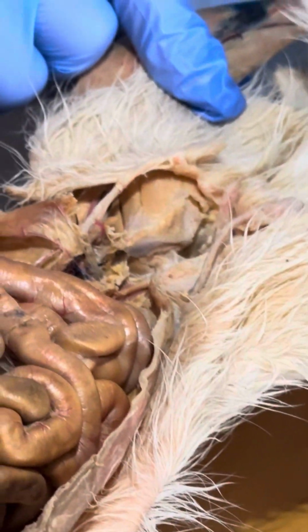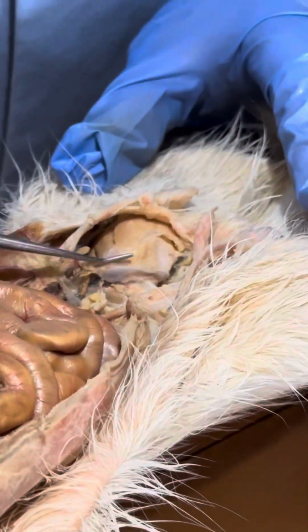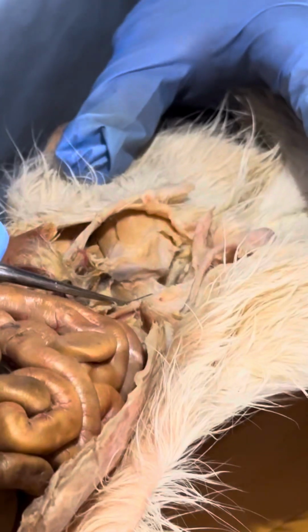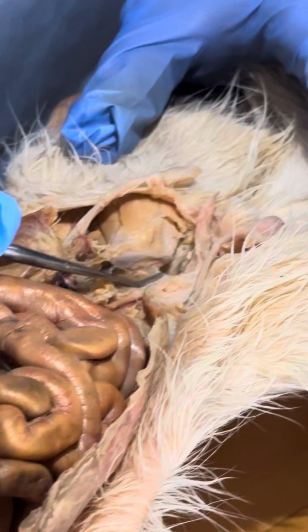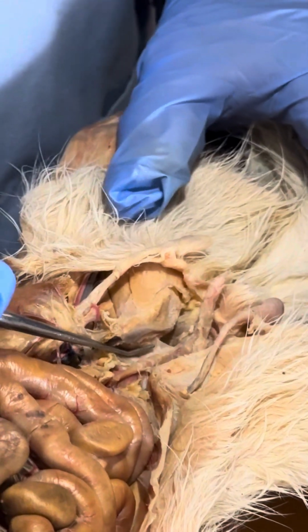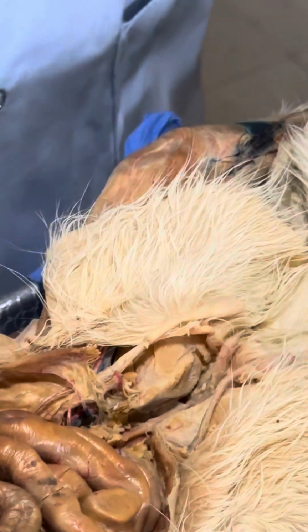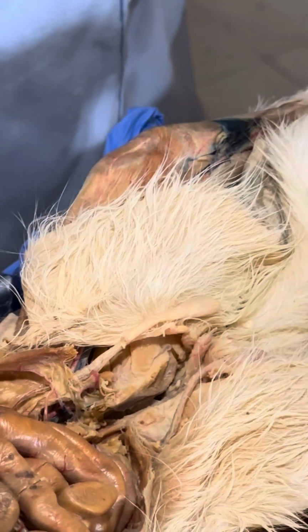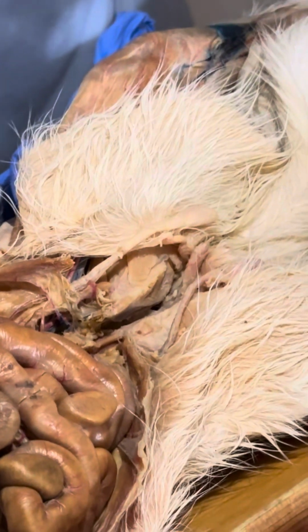And so what we have here, and you can see this on the female cat as well, there's a muscle right here called the levator ani. And the levator ani is shaped like a funnel. If you look at me for a sec, the funnel comes around, and then on the ventral side there's a urogenital arch, there's an opening.